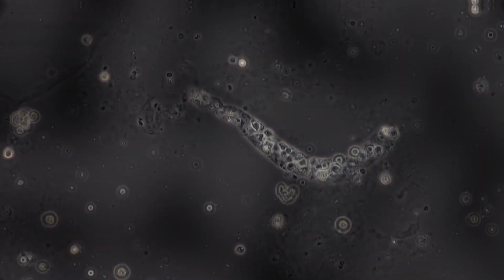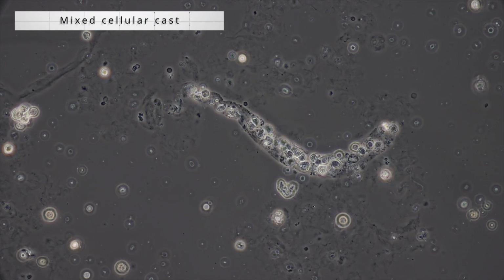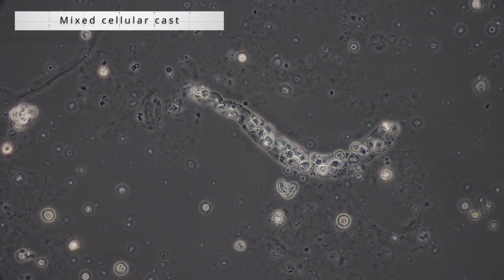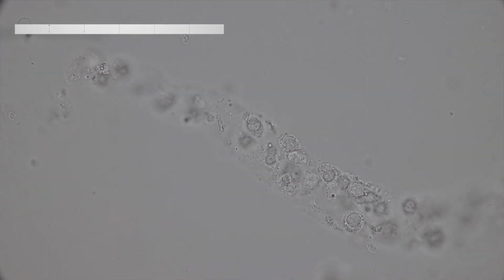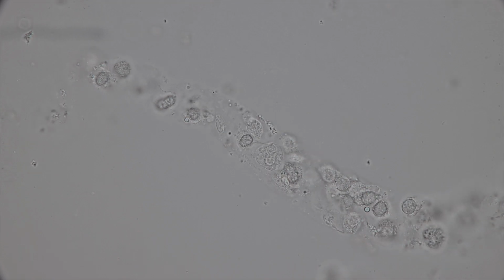Here is an example of a mixed cellular cast seen under phase contrast. We're going to go in for a closer look under the 100x oil objective. This is an unstained specimen. As we focus up and down, you can see the different cell types.